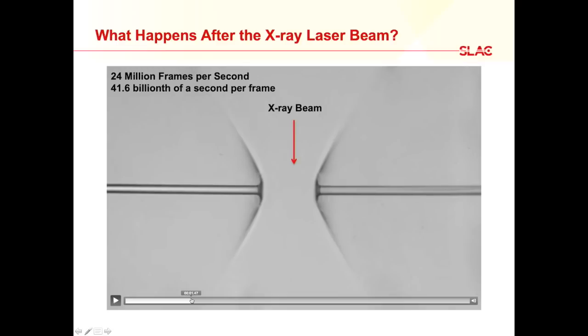So as I said, amazingly this happens even though we're able to make a real measurement of the very fine details of the position of the atoms we're interested in. This gap in the jet here is millions of times bigger than the features we're trying to measure.